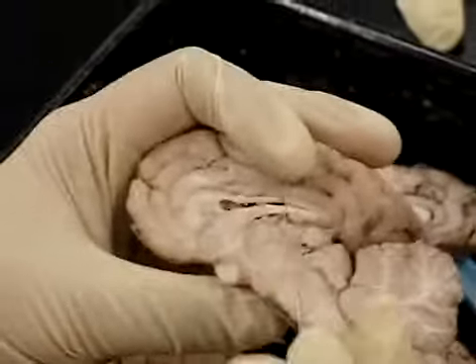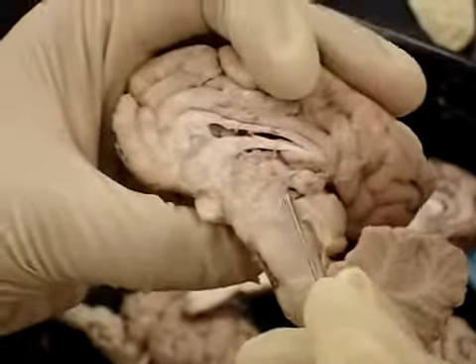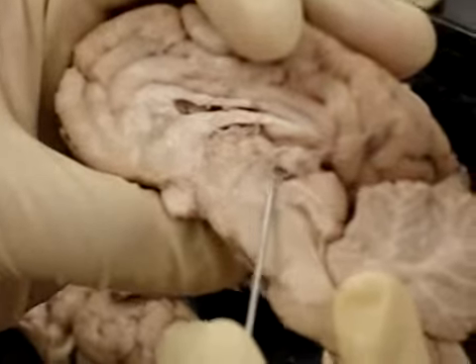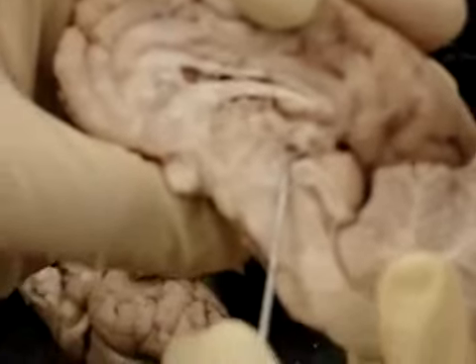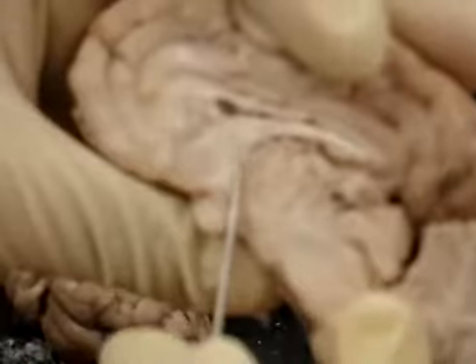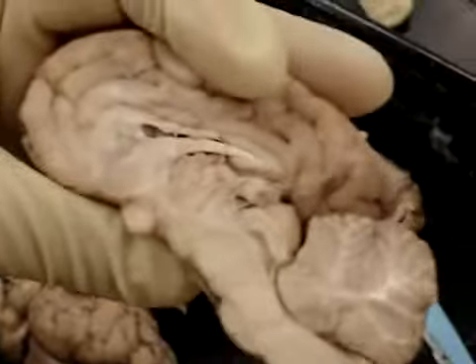The posterior commissure is, so there's the massa intermedia. There's a whitish portion posterior to the massa intermedia, and that's the posterior commissure. It's this tiny area right here. And basically, the commissure connects. It also helps connect the two hemispheres together. There's one whole piece of tissue. The anterior commissure is in front or anterior to the massa intermedia, so it's this one, this area. And if you look at other brains, it's slightly whiter than the surrounding tissue.